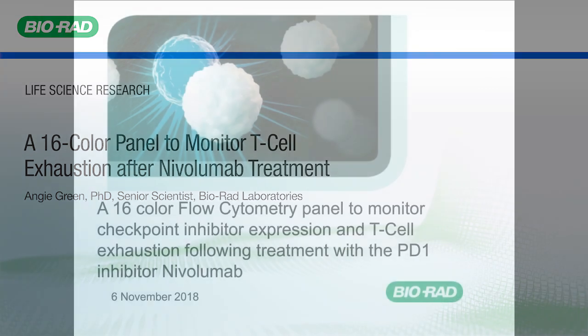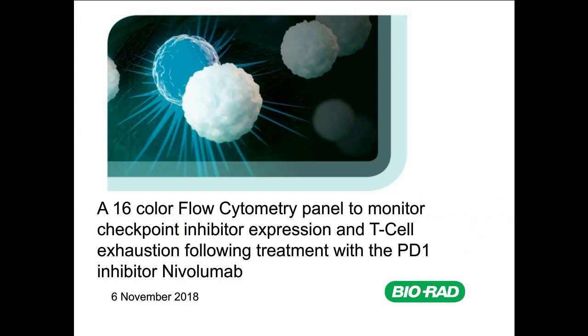and welcome to today's webinar event, a 16-color flow cytometry panel to monitor checkpoint inhibitor expression and T-cell exhaustion following treatment with the PD-1 inhibitor nivolumab. This is Michael Krieger with Bio-Rad. Thanks for joining us today.